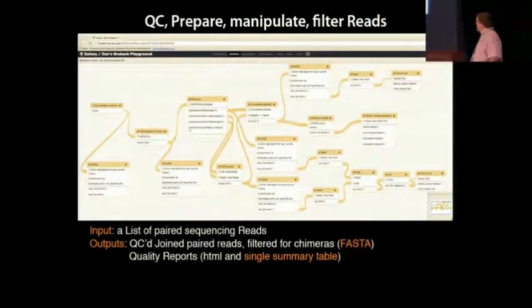And you can do this in Galaxy here with a workflow. Once these tools are available on usegalaxy.org, this workflow will also be available. So this is a typical workflow where we do FastQC reports along the way from our original data, then after trimming, after joining, and so forth. In this case, we're actually using two different types of joining. We're going to join where we actually merge the reads together, but at this merge step, it's actually going to kick out your unmatched left and unmatched right-hand reads.